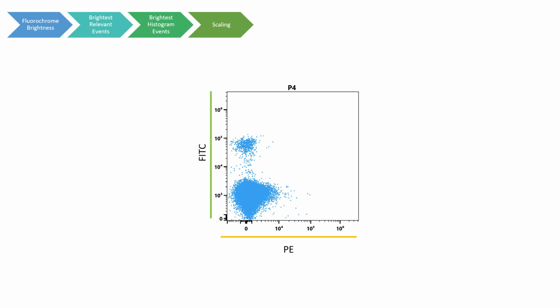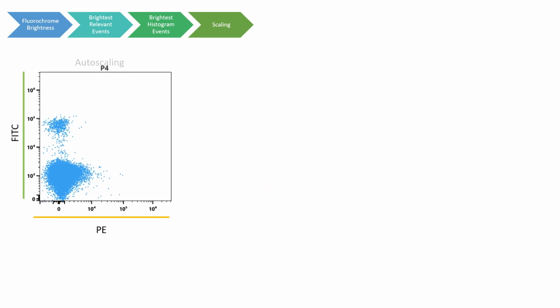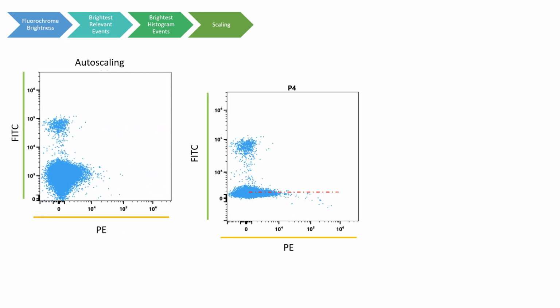A big problem can occur here if your sample of interest is super rare. Here I have some T cells, and I am expecting some rare signal in PE, but it looks like there is almost none. This is using the auto scaling, which is an issue because it doesn't always show all of the events, and it appears to bias towards the majority. First of all, if I alter the bi-exponential axis to look further below 0, we can see an unmixing error that is quite easily missed in Spectral when using auto axis. So now I can see this, I need to check the brightness of my reference when compared to the sample.